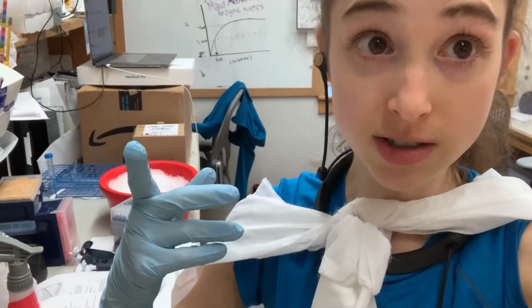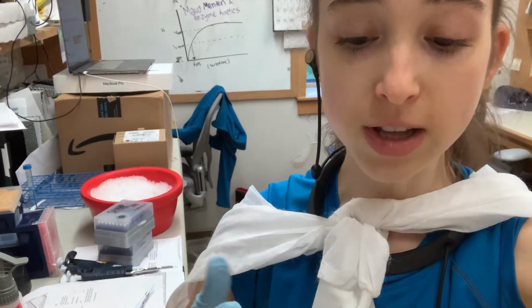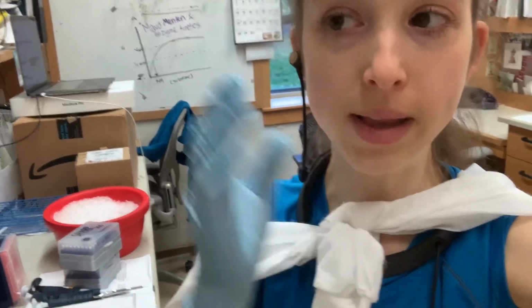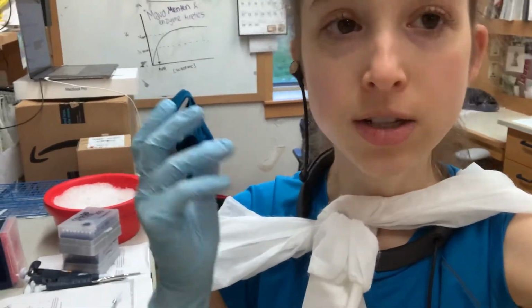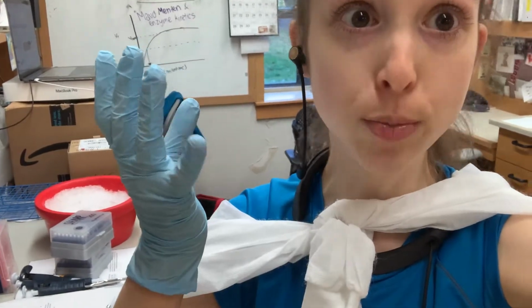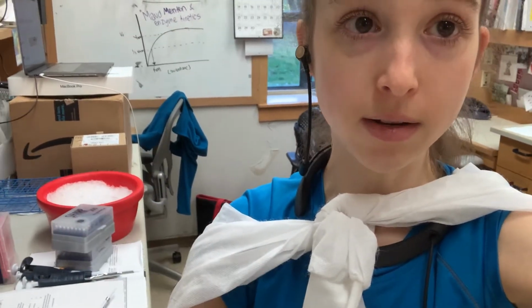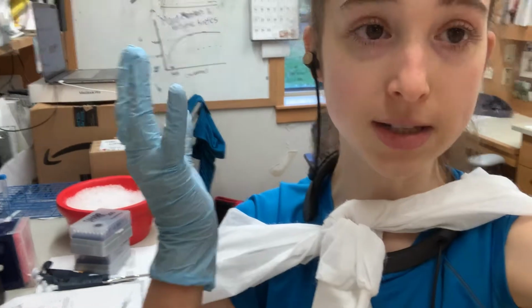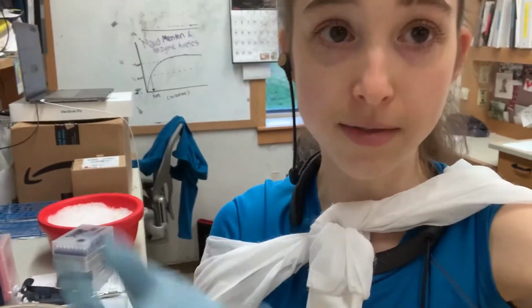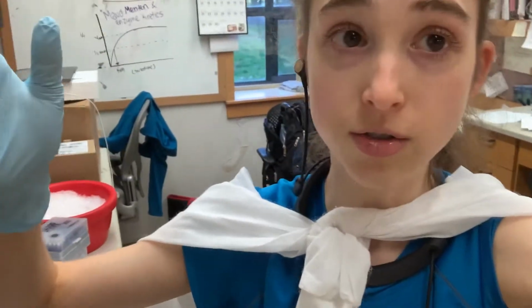When determining what concentrations you want to make, you typically want to make a high concentration so that you don't have to add very much, so that you have plenty of room to add whatever else you want to add. If Starbucks made a super dilute syrup for their drink, their drink would be 50% syrup and only 50% coffee, and it wouldn't be coffee enough. You wouldn't have enough room to stick in enough coffee to have enough coffee flavor. So it's good to have a higher concentration of the thing.